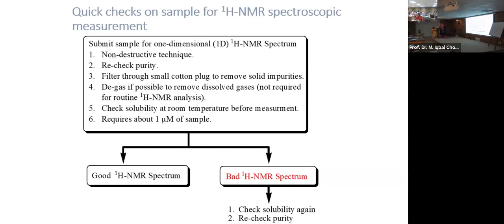It is minus 269 degrees Celsius, and just a centimeter away, you have so much control that not only can you analyze any room temperature sample, you can run experiments at higher temperatures, and you can decrease the temperature as well. No other technique gives you that much control. So if your compound is soluble at room temperature, that's well and good.